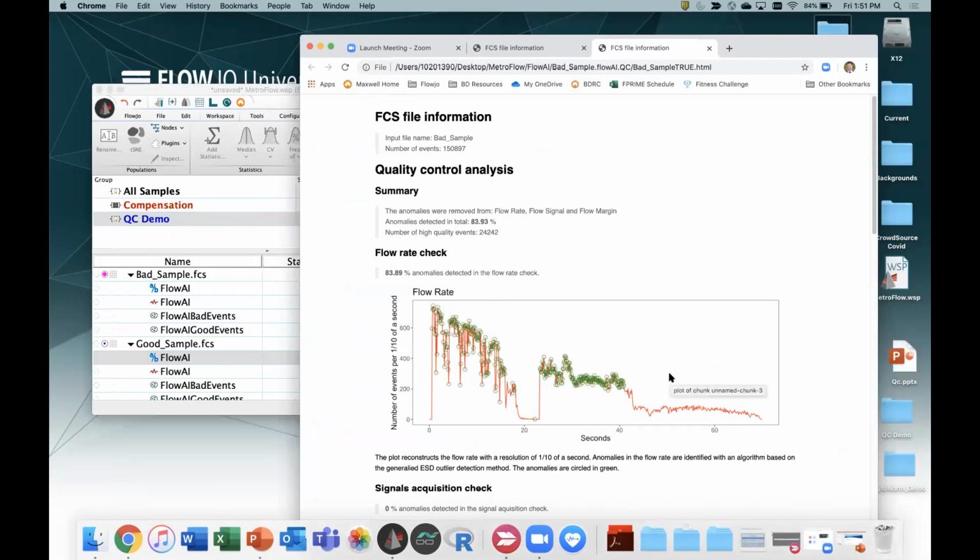So this is what happens when your flow rate varies dramatically, maybe stabilizes down here, jumps back up, maybe stabilizes at the end. So the algorithm is trying to figure out whether the higher rate or the lower rate is actually normal or average. The lower rate had this long period at the end that makes it win on what seems to be the most average. So everything at the higher rates is taken out; it's just dramatically variable, which is a bad sign.